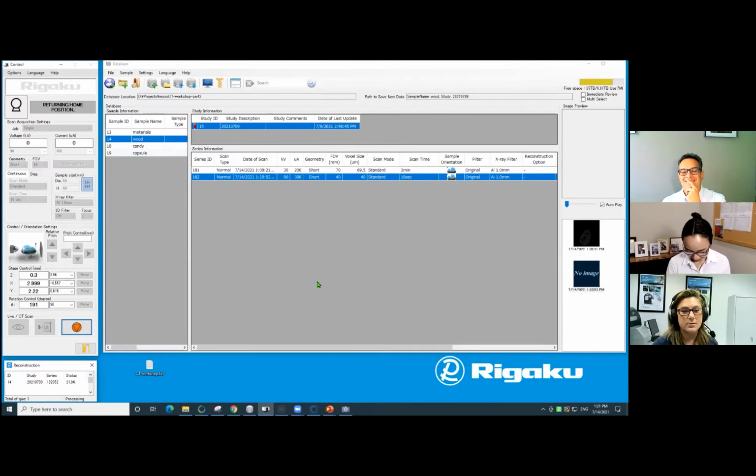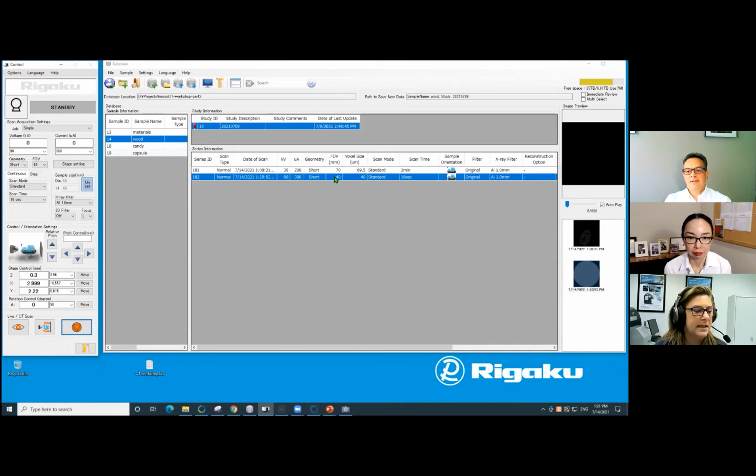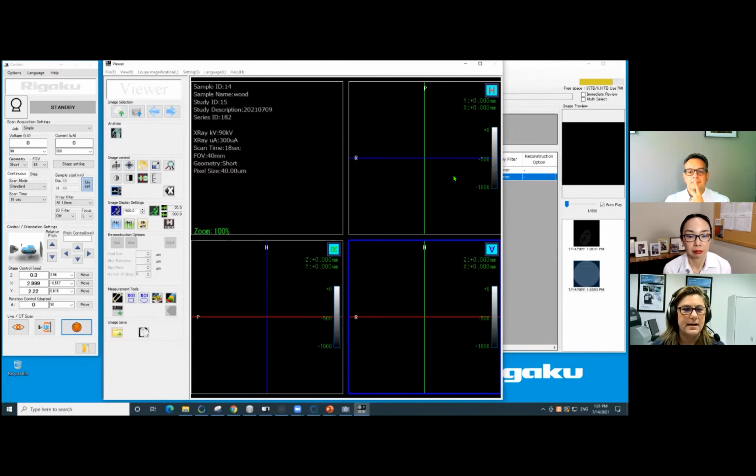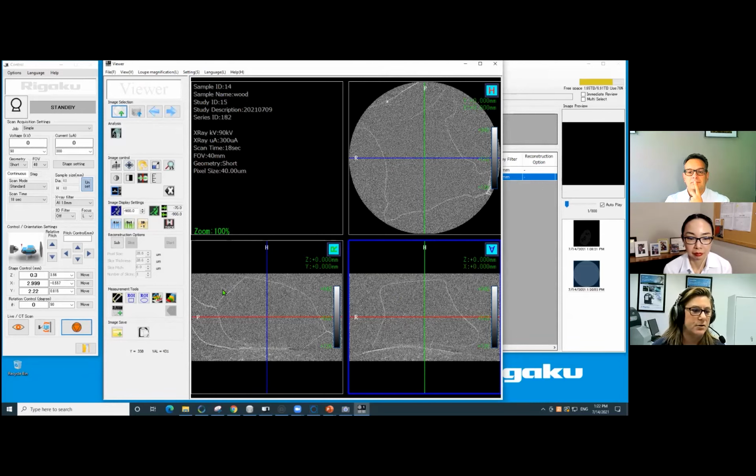That's right. If this was something you purchased, you would be extremely disappointed when you opened it, or your children might be, or your Halloween guests, I guess, if this is Halloween candy. It turns out that I have very carefully replaced one with a small piece of styrofoam, and the other one just contains air. The sample that we see here is in fact completely empty. We just see the light wrapper, not interesting at all.